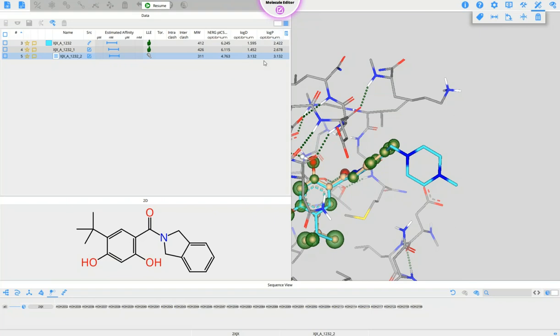So keep an eye on that if you know what your targeted area is. If you try to get into the brain, if you try to get into the human blood, or if you try to get into a bacteria, you might be very interested in looking at the log D or the TPSA. So you can have a look on those parameters here as well in the table.